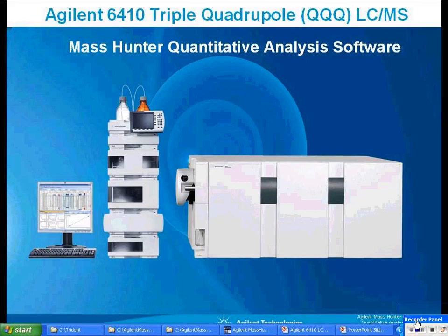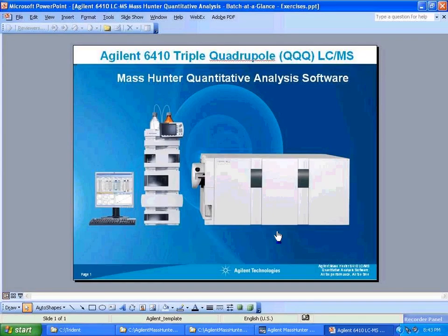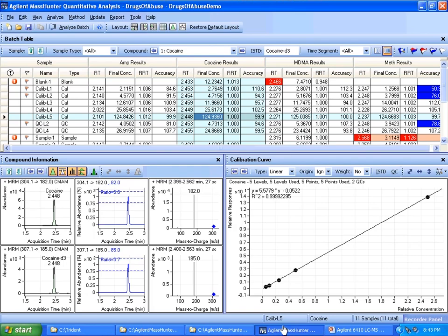Discuss the calibration curve in terms of batch at a glance. Obviously, the calibration curve is the centerpiece of quantitation. And if I look at batch at a glance, I'll see my calibration curve over here. And let me zoom in on that to get a better look.